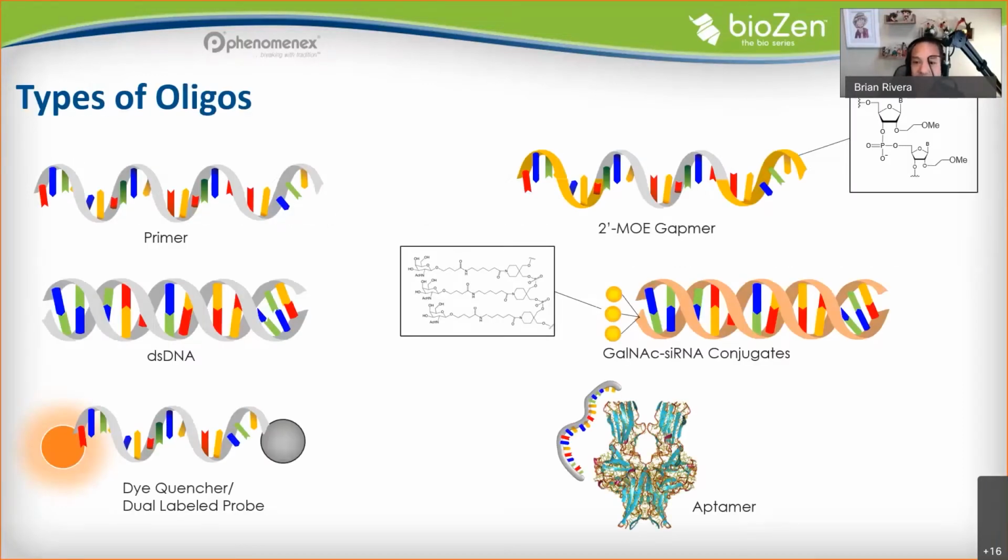And we, of course, all know these things, but because I like to make the joke of a primer on oligonucleotides, oligos are short DNA or RNA oligomers, typically 20 to 60 mer, manufactured by solid phase synthesis, and they, of course, bind in a complementary manner. There are different types of oligos depending on, of course, the application.